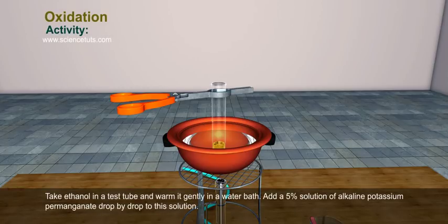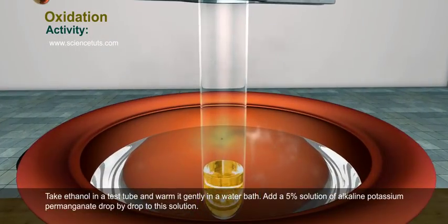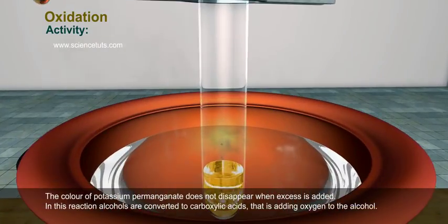Take ethanol in a test tube and warm it gently in a water bath. Add a 5% solution of alkaline potassium permanganate drop by drop to this solution. The color of potassium permanganate does not disappear when excess is added.